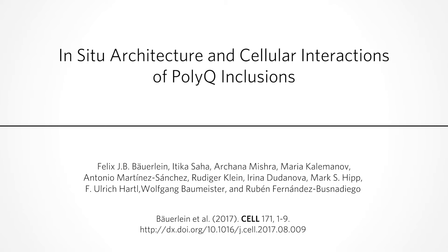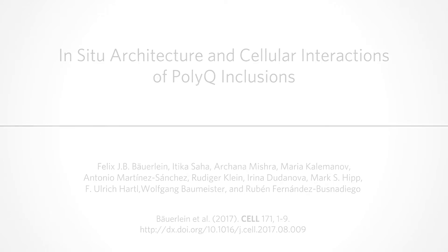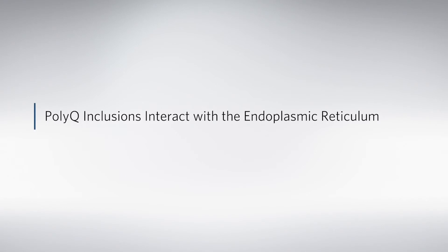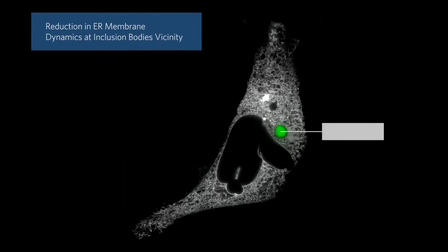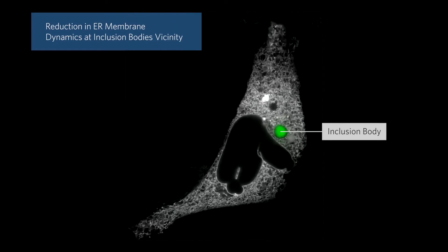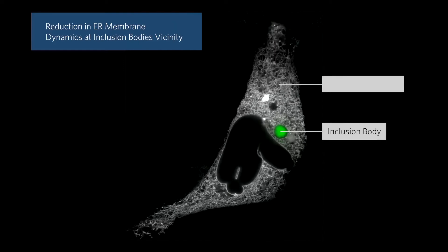Here we analyze the cellular consequences of polyQ aggregation using a variety of microscopy techniques. By live cell imaging, we observe that polyQ inclusions interact extensively with the membranes of the endoplasmic reticulum, or ER, and that these interactions lead to the abrogation of ER dynamics and other deleterious effects.